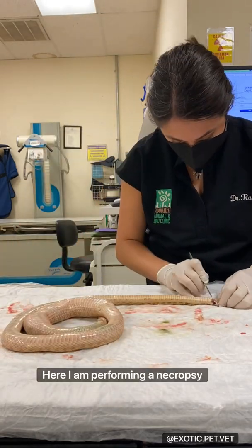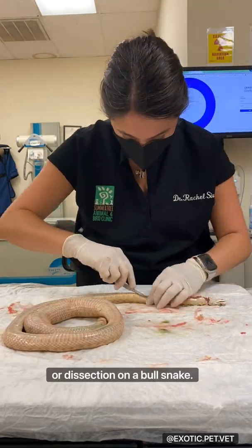Warning. Here I am performing a necropsy or dissection on a bull snake. Viewer discretion advised.